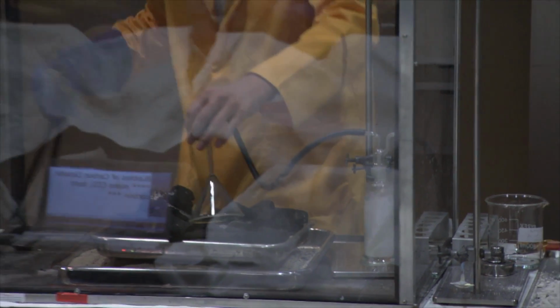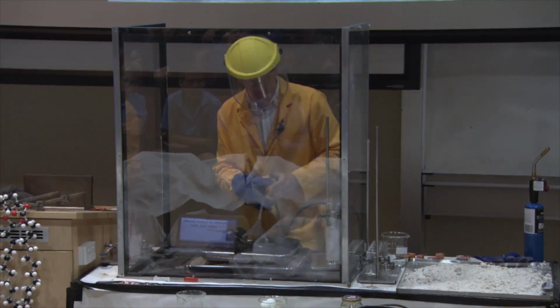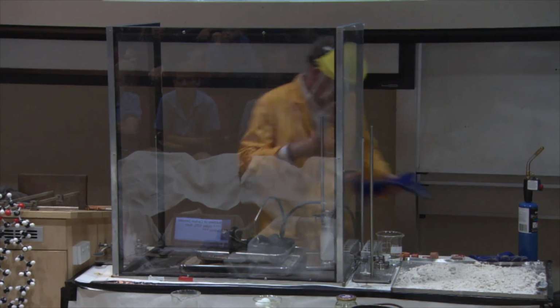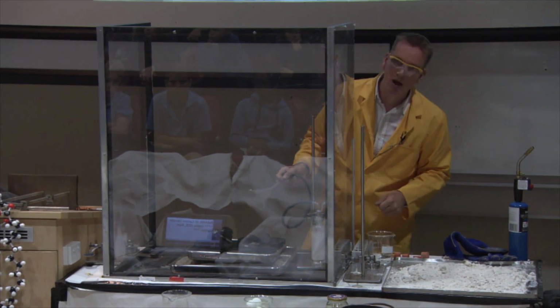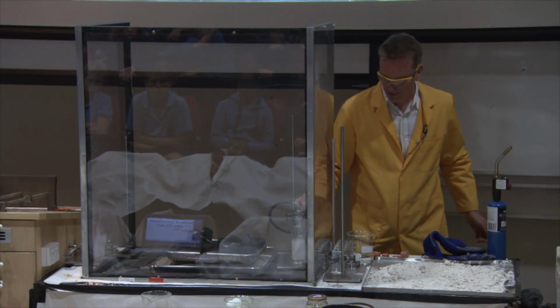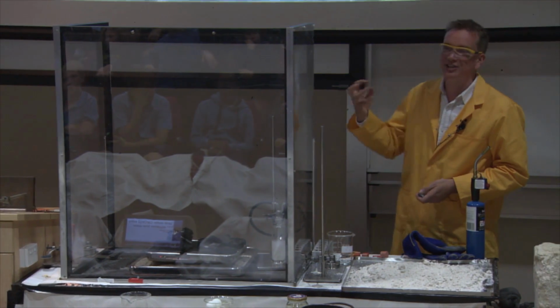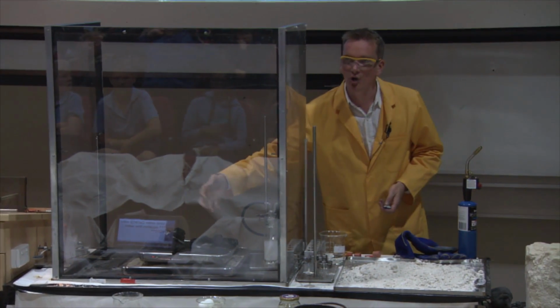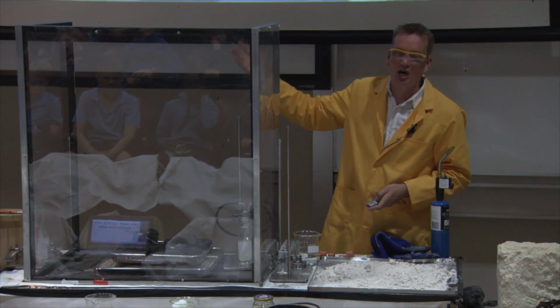Oops, I'll just leave that there for a second if I just hand that back. Thank you. So it's certainly changed now. It's gone very, very cloudy. It's gone very white. Switch the pump off there. The chemical reactions that have taken place, well, we had the carbon reacting with the oxygen. So this was our charcoal, the carbon there, reacting with the oxygen that I was putting on this and the oxygen from the air. That gave us the carbon dioxide.